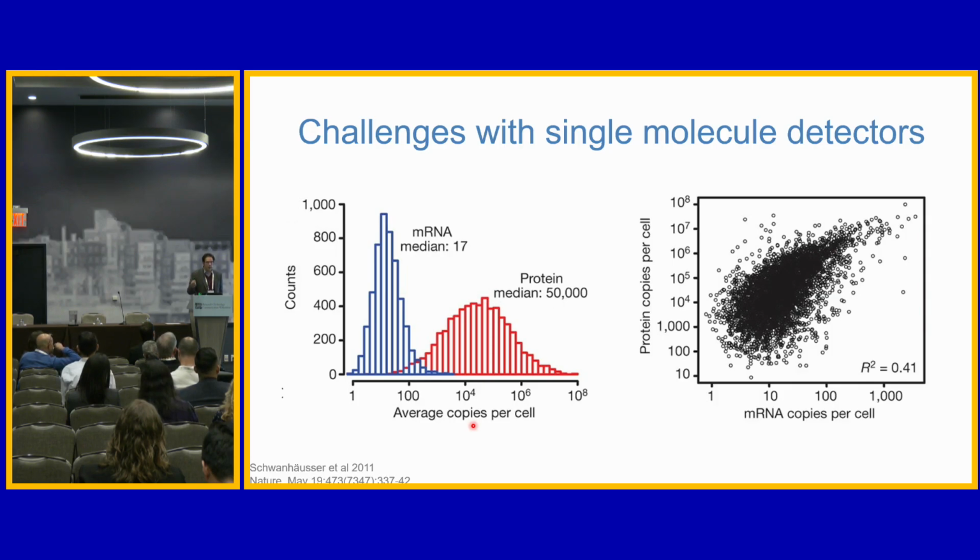So in these particular proteomic technologies, we have to remember that there is no vetting, at least at this standpoint, of how good a quality any individual binding reaction actually is. And so there's no idea of a detection false discovery rate as well as a quantification false discovery rate.